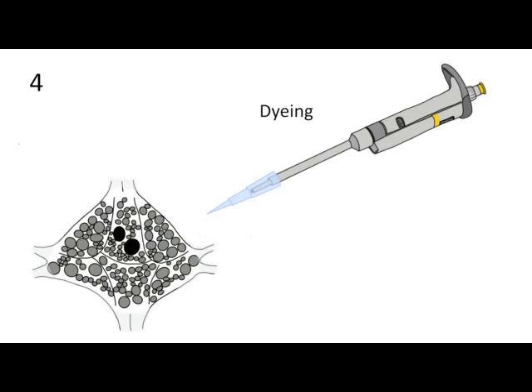Next we dye the ganglion. Therefore we use the Fluorwold dye by Thermo Fisher. Since the dye is very light sensitive due to its phototoxicity, we work here under red light as soon as we use the dye. We already prepared the Fluorwold dye as it was described by Thermo Fisher Scientific and we remove the saline in the petri dish with the ganglion and now replace it with 1500 microliters of the dye.